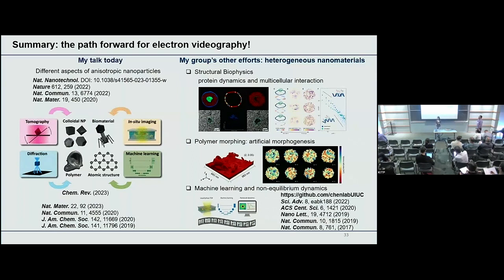We can have something very similar for nanoparticle superlattices too. We have another work where we measured the surface stiffness term for different faceted supercrystals, and indeed, there's a facet dependence. Growth habits are more like a thermodynamic argument about surface energy, while here it is more about kinetic growth modes. So they are related to each other.